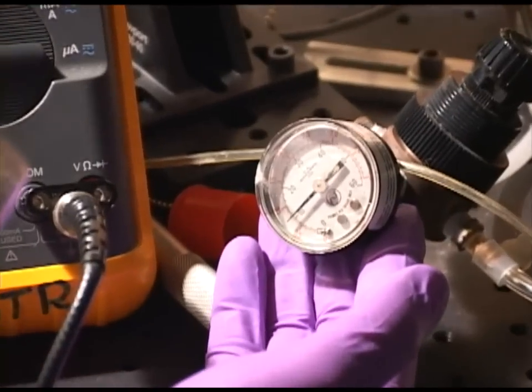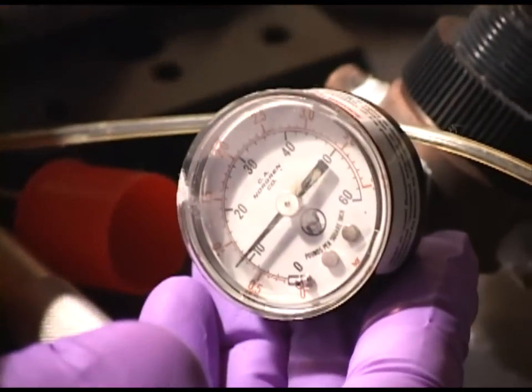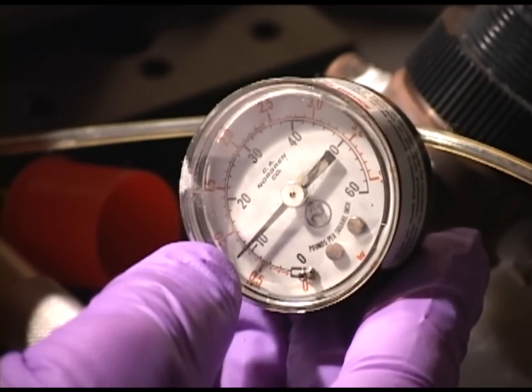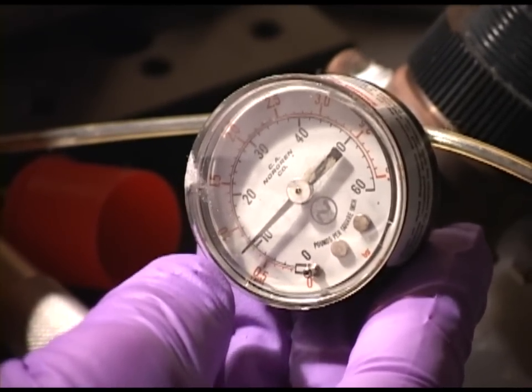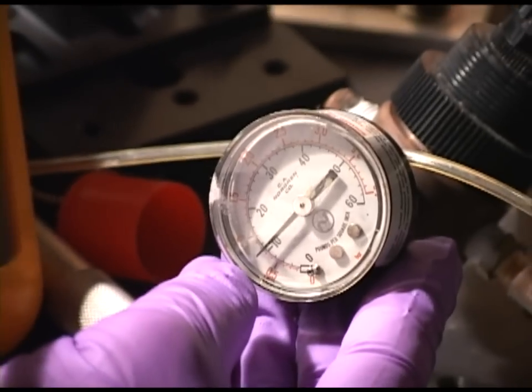First step in mounting the sample is to check the pressure reading on the piston. When mounting the sample, we want the pressure to be set somewhere between 10 and 20 psi. If the pressure is too high, when the piston is applied, the sample could crack.